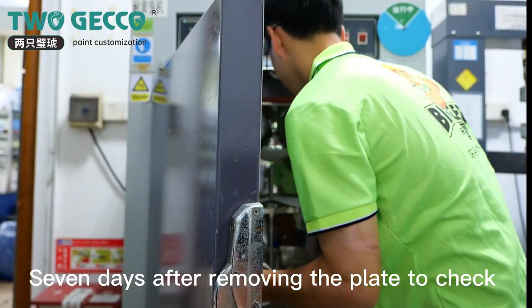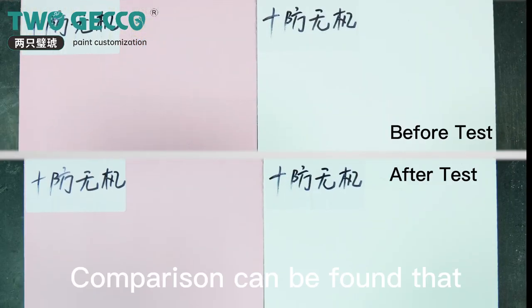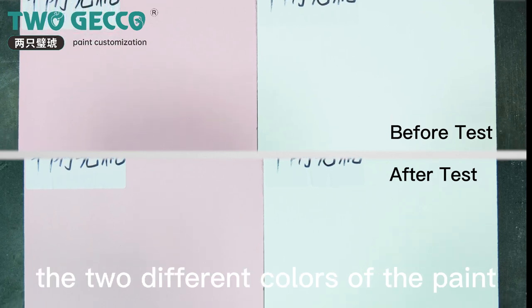Seven days later, remove the plates to check. A comparison can be found that the two different colors of paint show no aging, cracking, or other conditions.